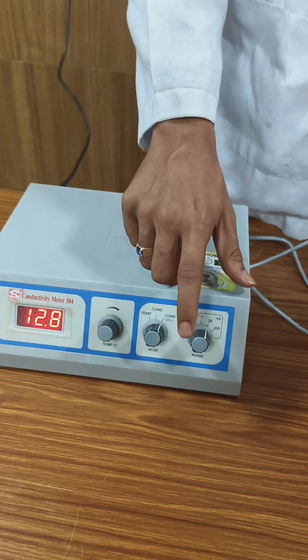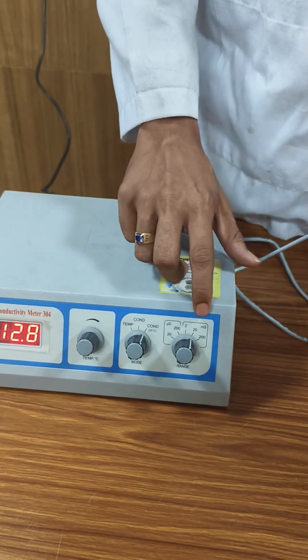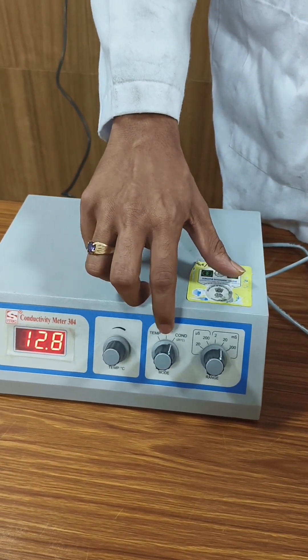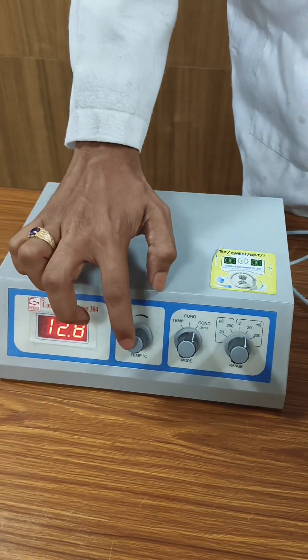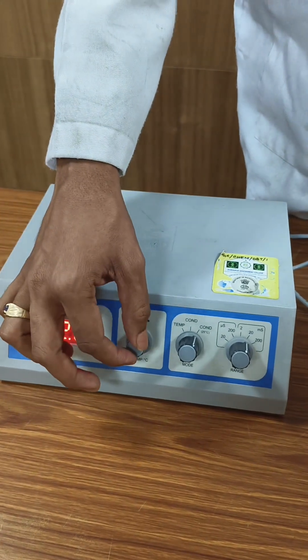Now here are three knobs. The first knob sets the unit in microsiemens or millisiemens. The second knob has three levels: temperature, conductivity, and conductivity at 25 degrees Celsius. The third is the temperature knob to adjust the temperature up or down.